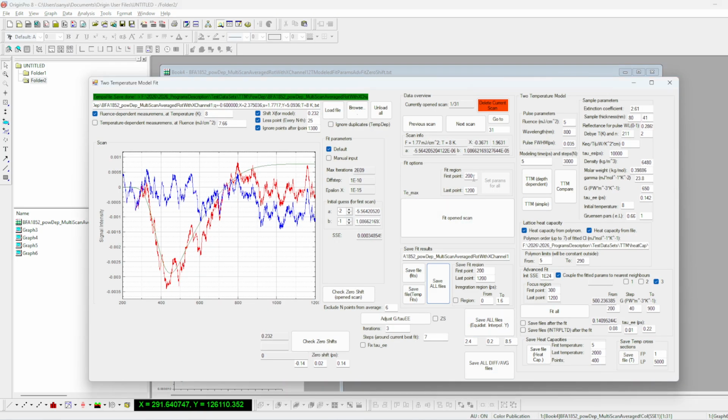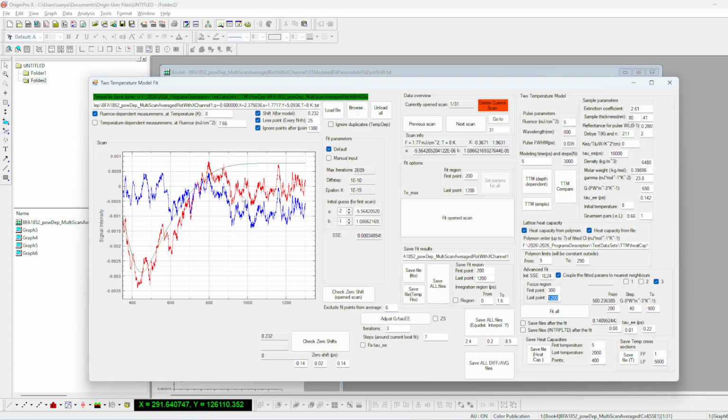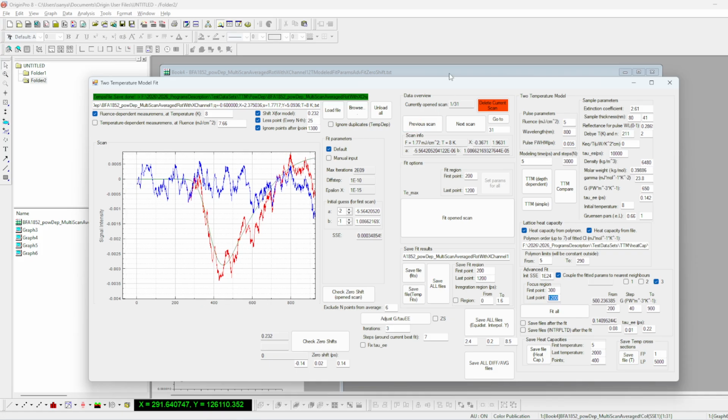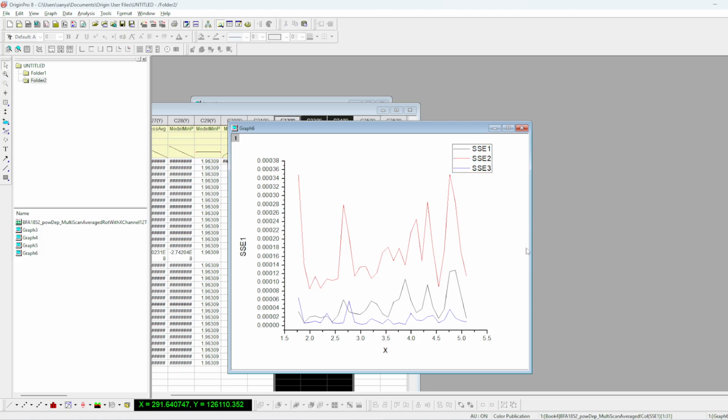So there is the focus region, and you can look inside of the focus region, inside of all data from 0 to 300 to check how it changes, or just inside of pre-0, before 0, the sum of square errors, just to make sure that everything is fine.